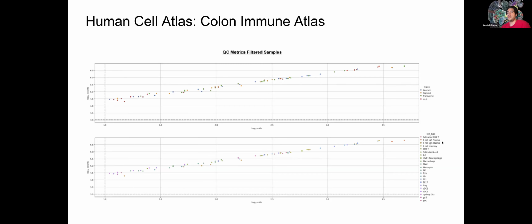So we can see here, LIANA was able to make the cell-cell interactions in UMAPs as well as ligand and receptor interactions. And then Scanpy was able to decipher the single cell RNA-seq data, just like LIANA, but give us the RNA transcripts in an activity plot, as well as a dendrogram and UMAP.